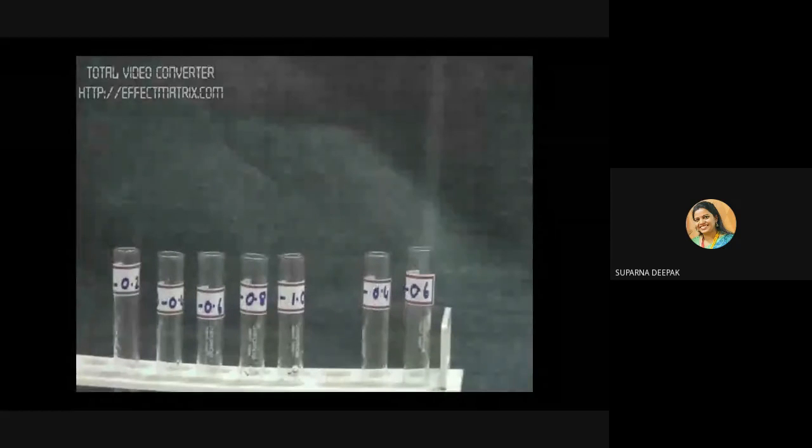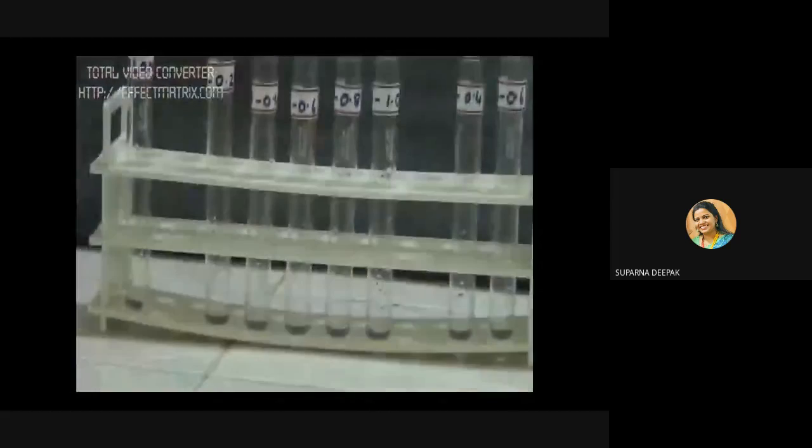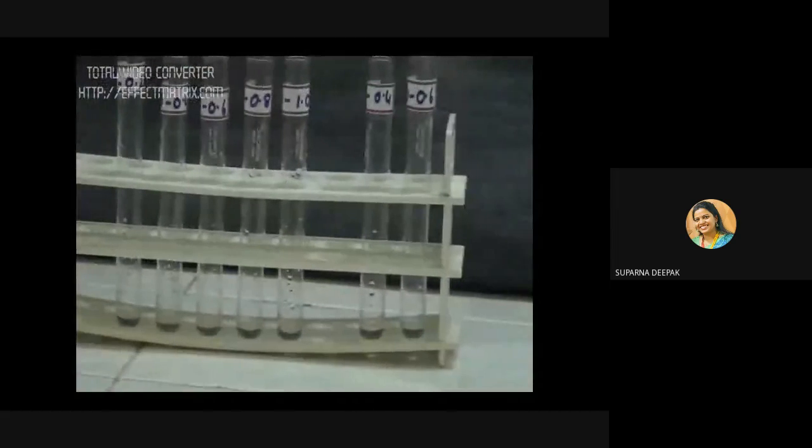We have 0.4 ml of our unknown RNA solution. So I will add 0.6 ml of distilled water. Next one we have 0.6 ml of unknown RNA. So I will add 0.4 ml of distilled water. So now all are at a level of 1 ml each.